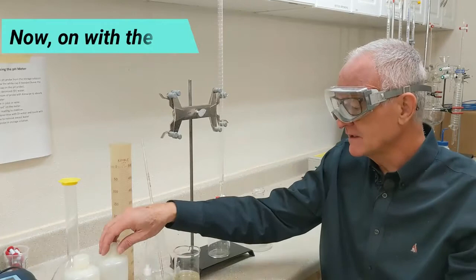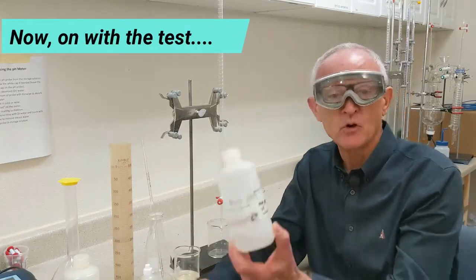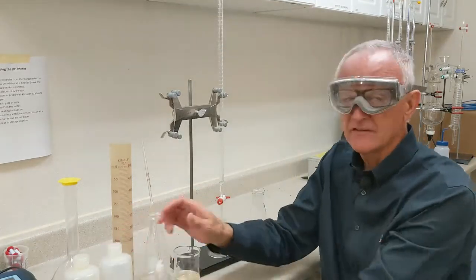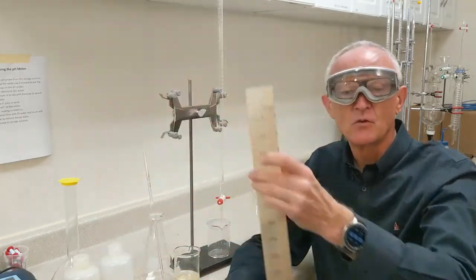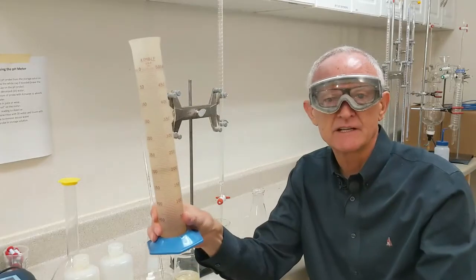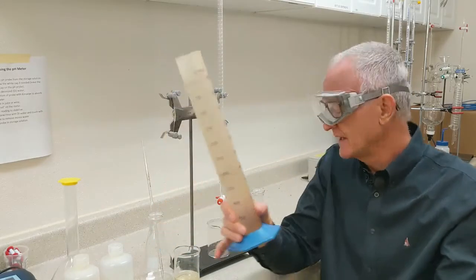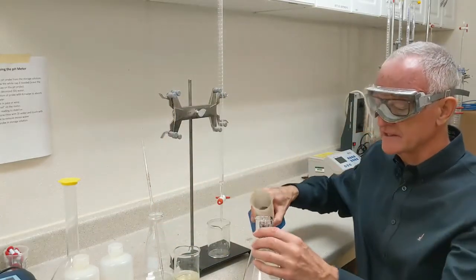I've got all that I need here. I've got 0.1 normal sodium hydroxide, I've got phenolphthalein. I have put 200 mils of water in this graduated cylinder. I'm going to add that to my flask.